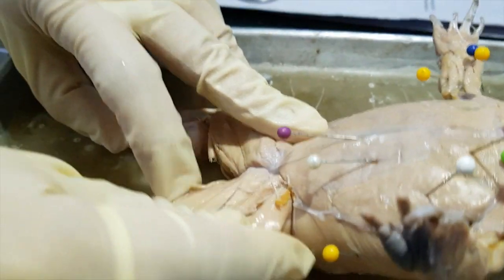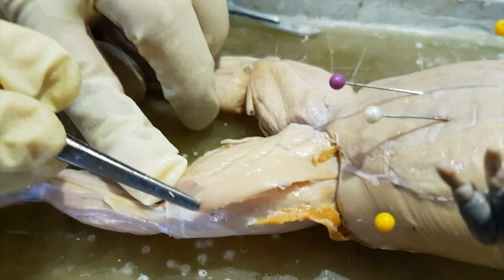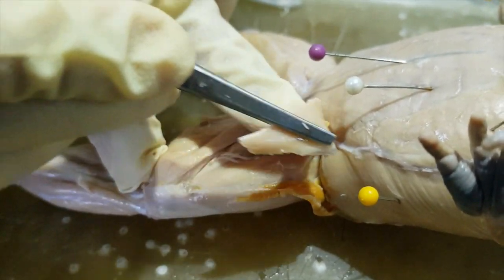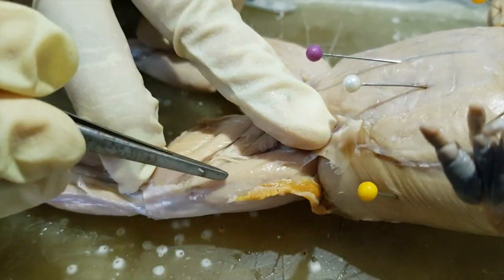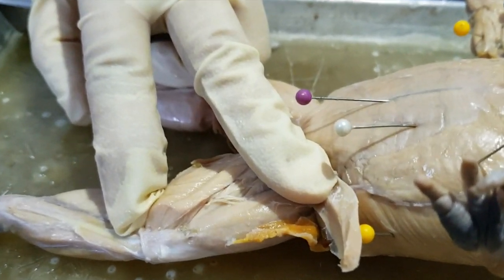And then we'll go to the legs. Okay, so for the legs, this thin flap of muscle that I already removed is the sartorius. Okay, so you have to remove or deflect that one in order to reveal the underlying muscles.